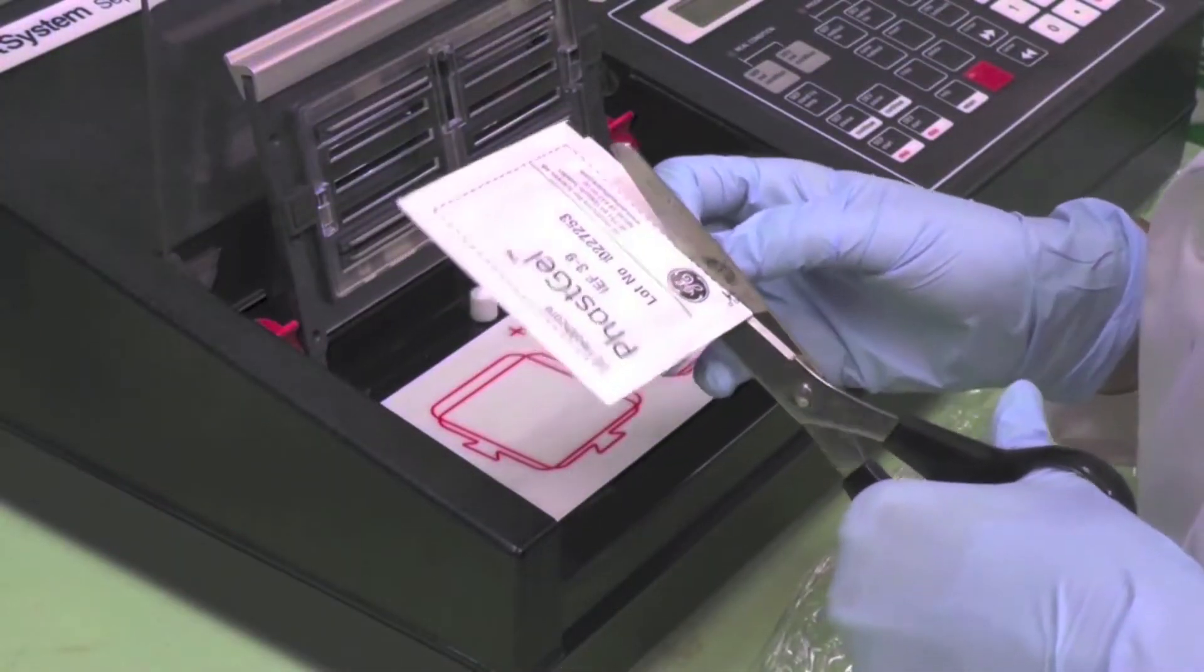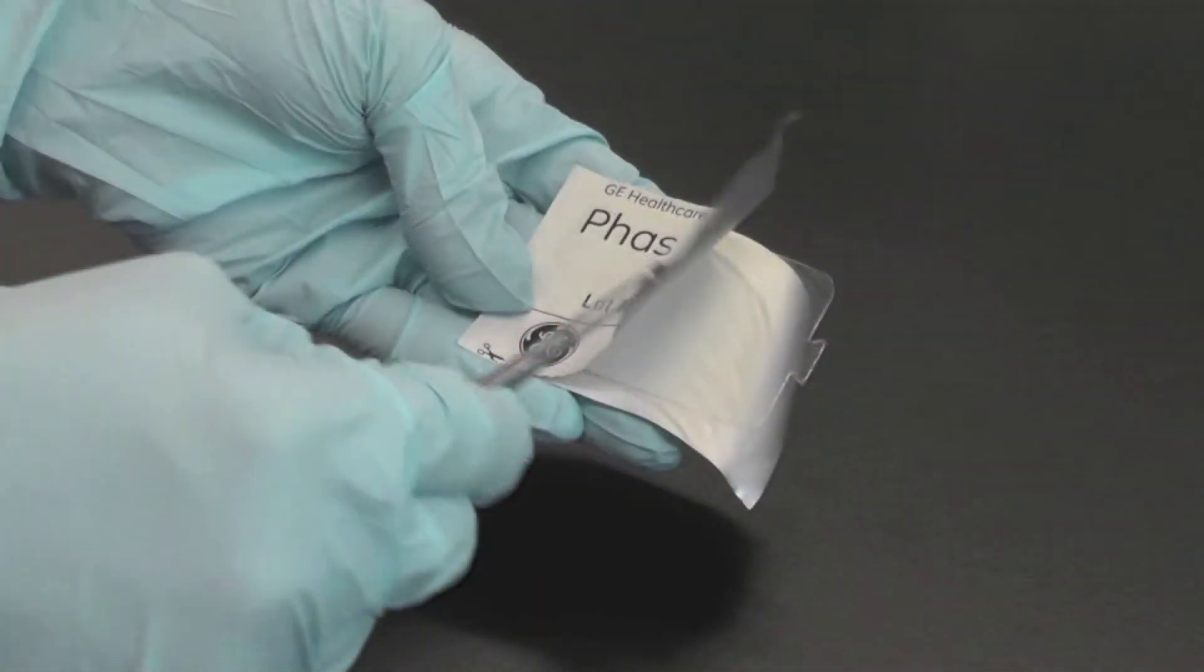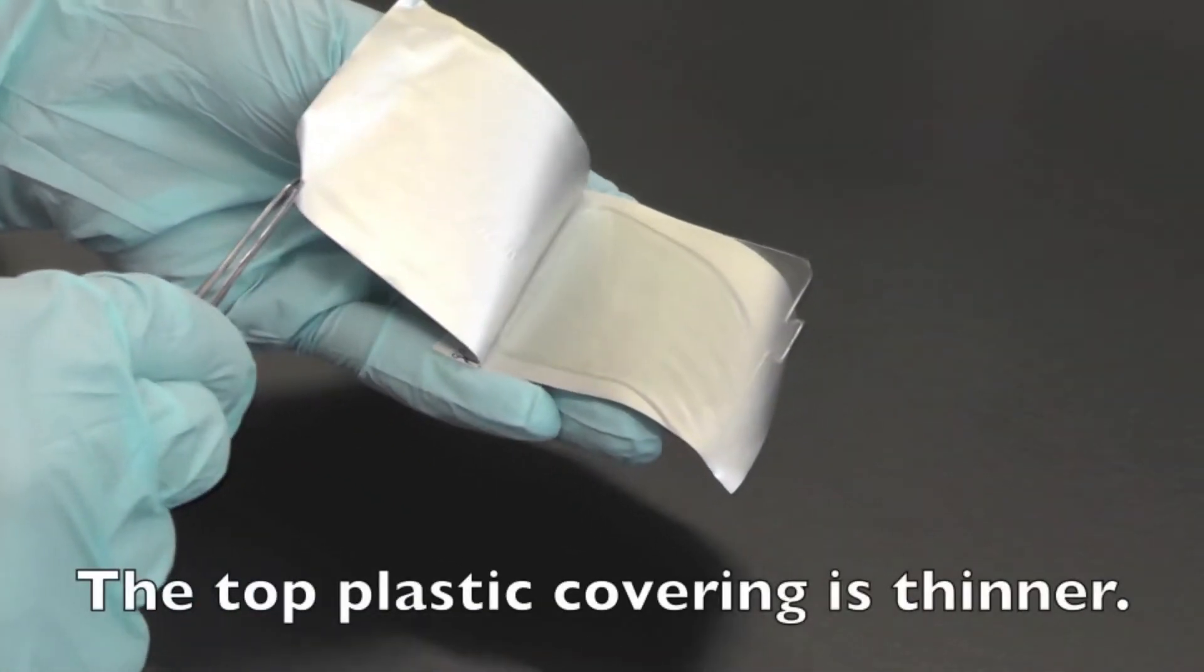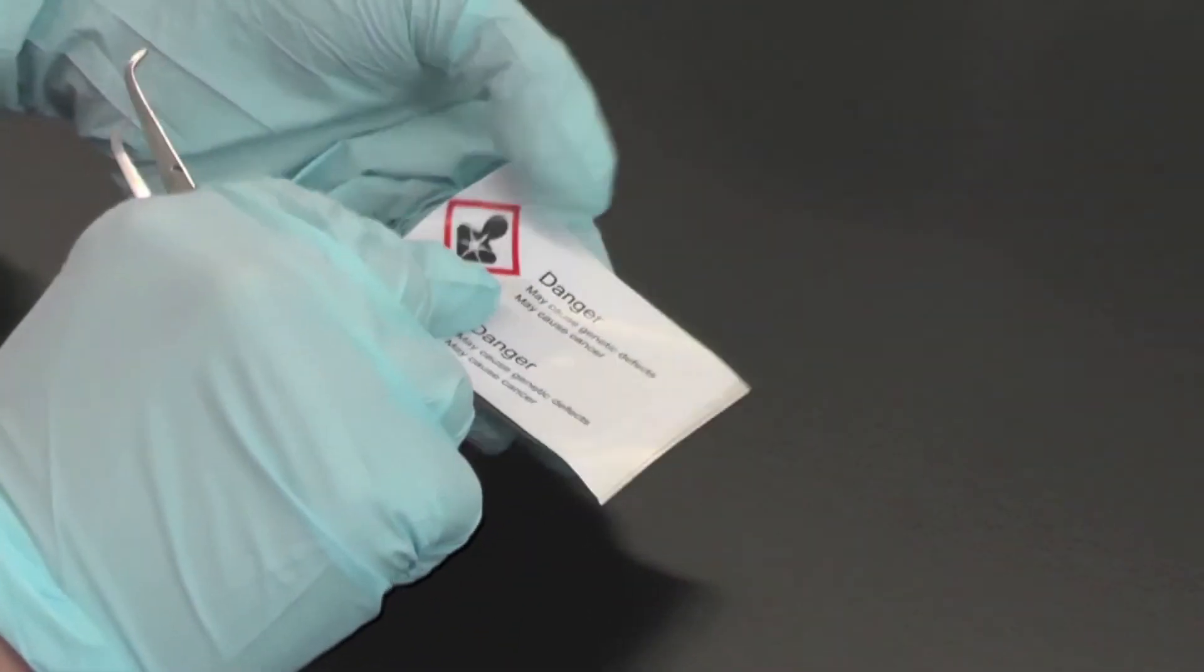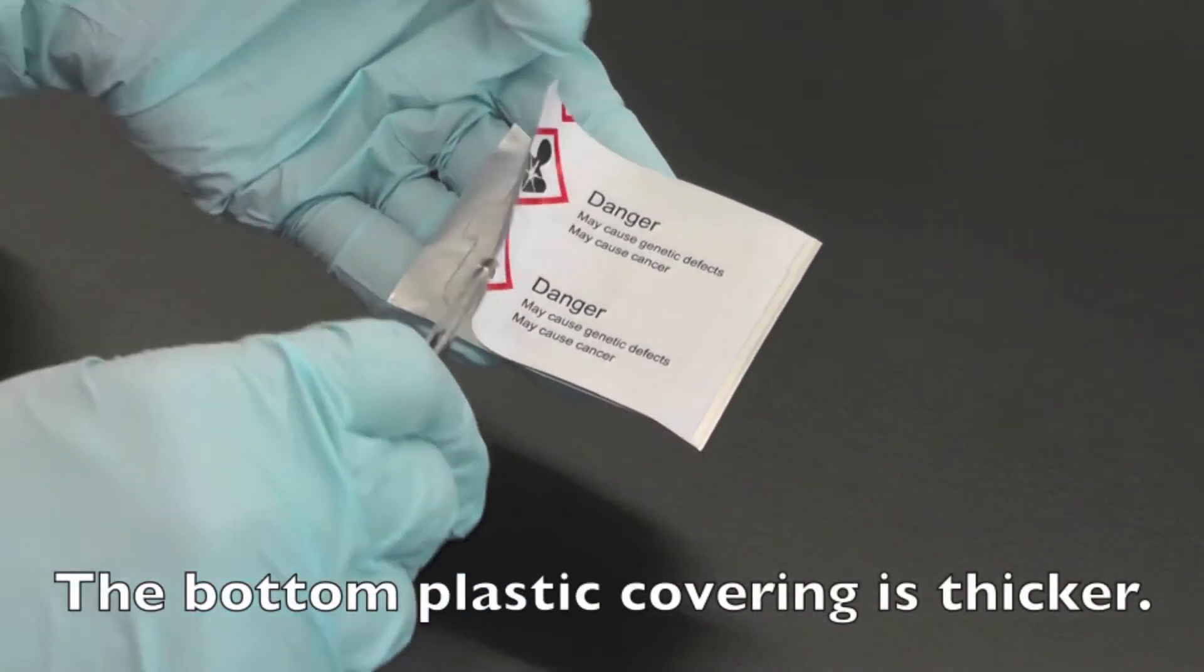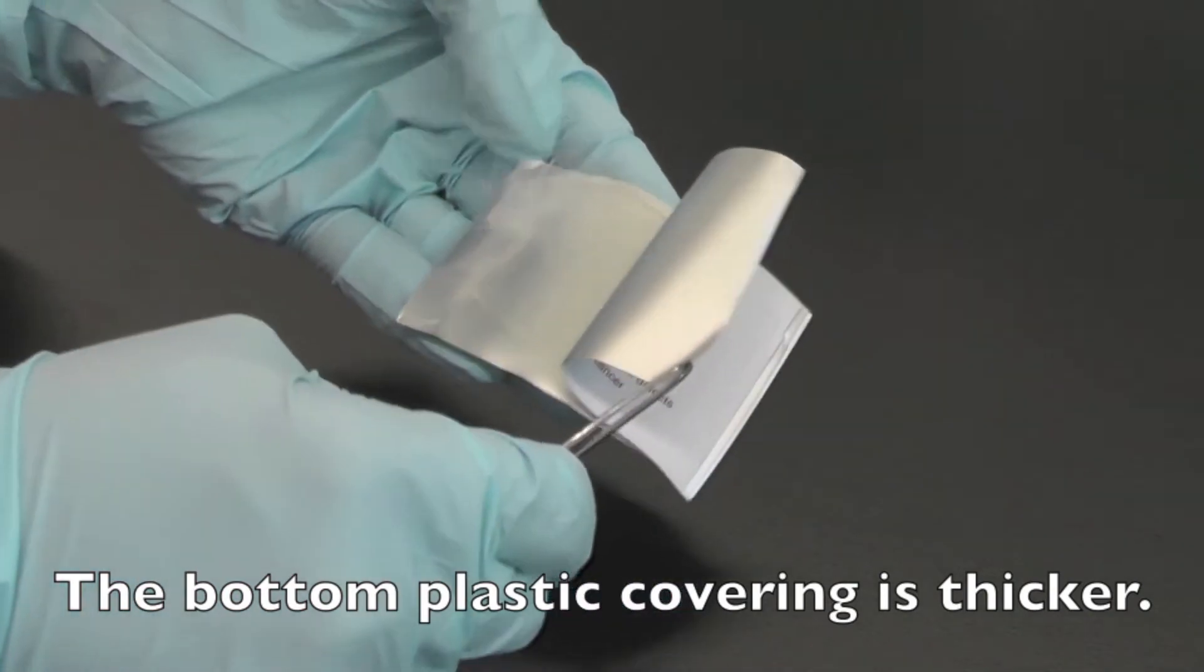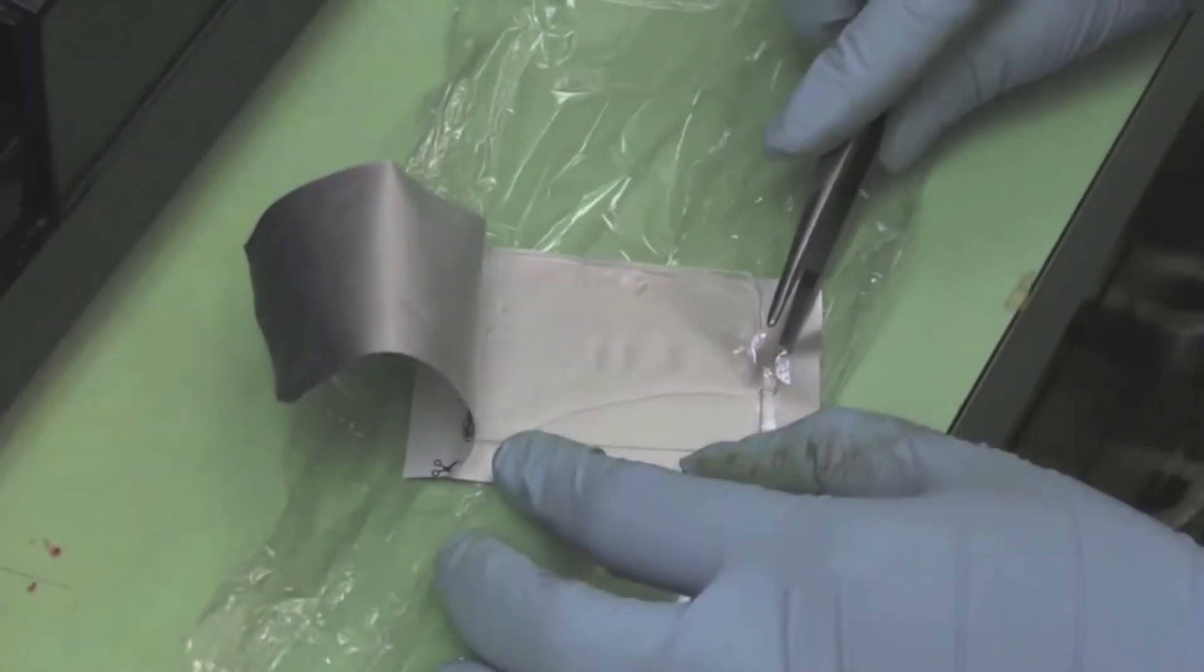Cut open the packaging of the FAST gel IEF. Both sides of the gel are protected by plastic covering. The top plastic cover is much thinner than the bottom plastic. While the thinner top plastic cover is to be removed prior to running the gel, the thicker bottom plastic should stay intact.